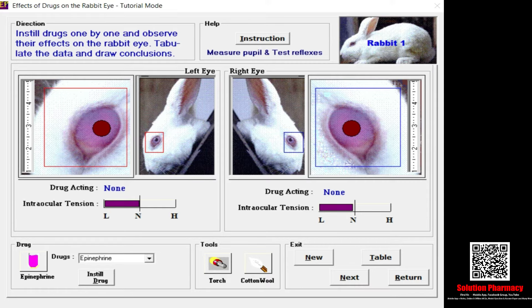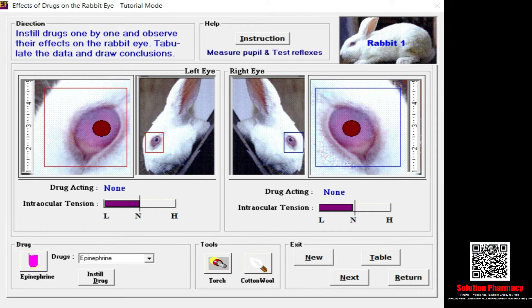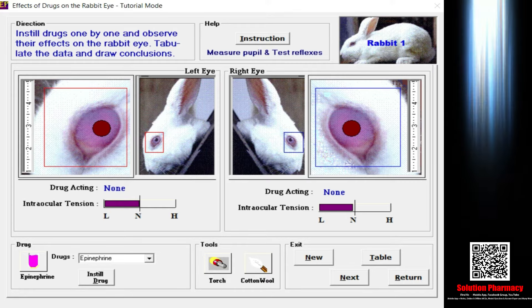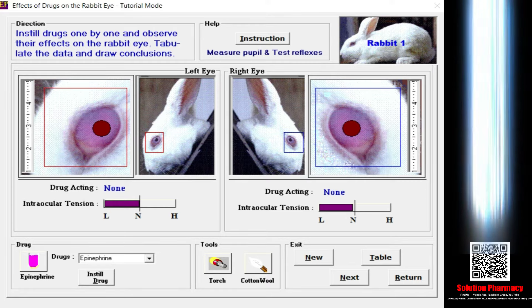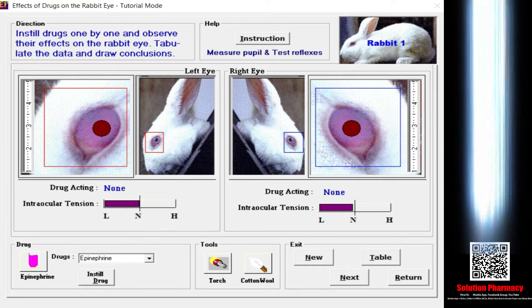Let's consider an example of the in silico method. The objective is to study the effect of a drug on the rabbit eye. For this experiment we use simulation software like xform to understand the concept of drugs acting on the eyes of a rabbit or any other experimental animal. I am going to explain the basic interface of this simulation software.